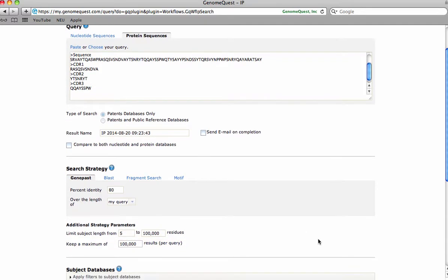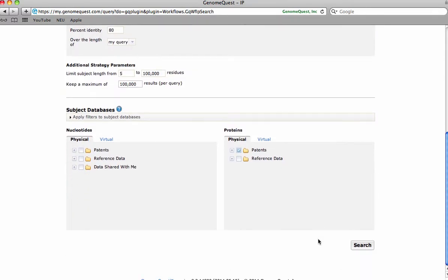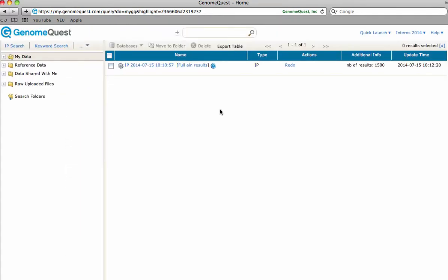Now hit Search. Once the search is completed, click on the IP report.